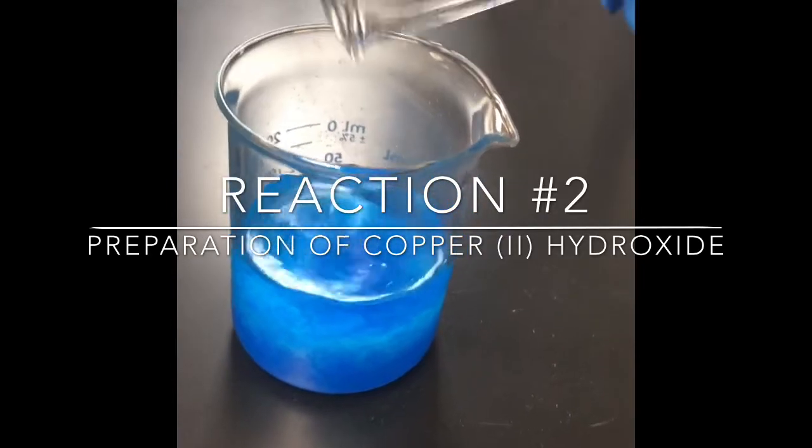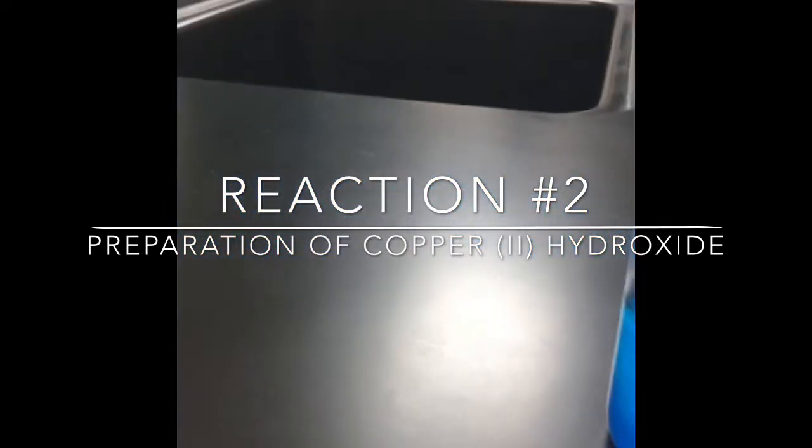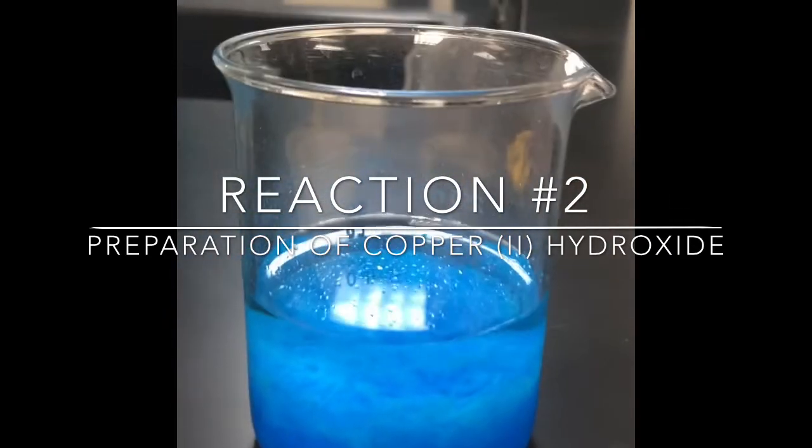And I like to think that this looks like flubber. Okay, so you see you got solid copper 2 hydroxide that kind of formed as a precipitate.